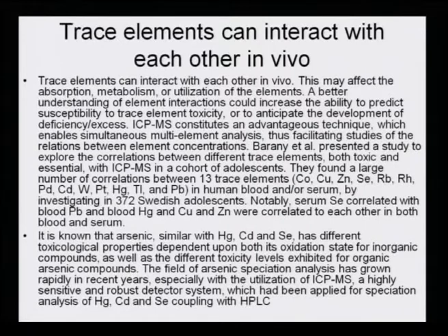A better understanding of the element interactions could increase the ability to predict susceptibility to trace element toxicity or to anticipate the development of deficiency or excess. ICP-MS constitutes an advantageous technique which enables simultaneous multi-element analysis, thus facilitating studies of the relations between element concentrations.